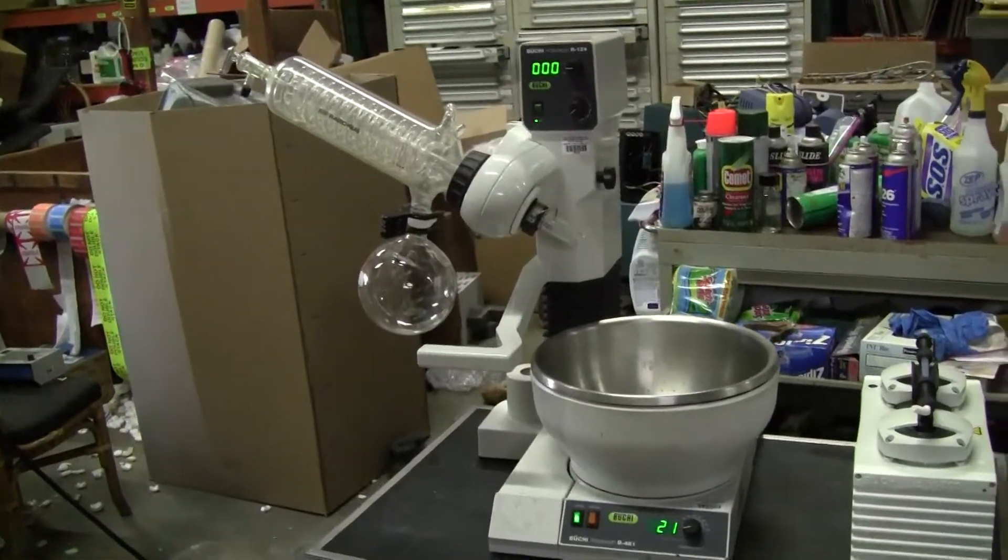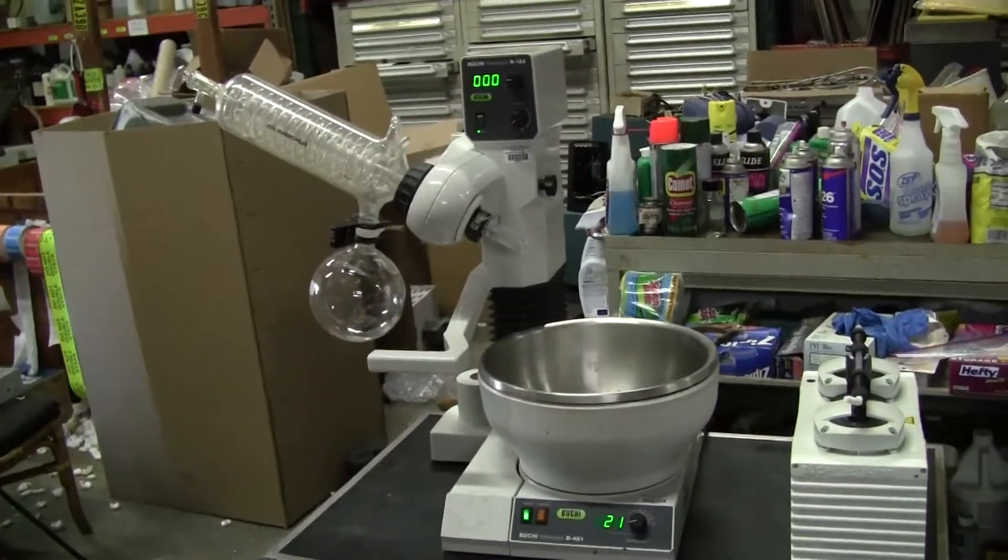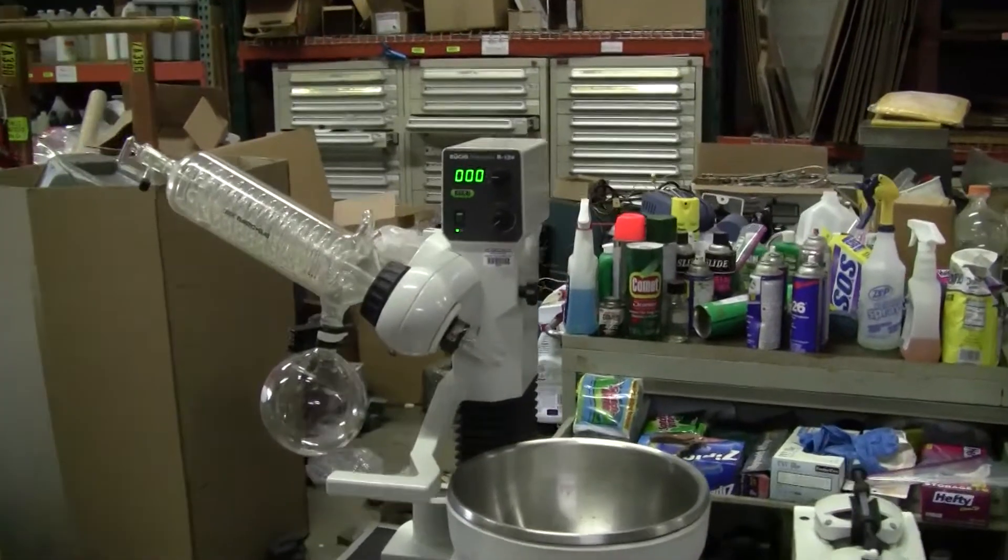Good evening, this is Michael Naitow from High Tech Trader. Today we're looking at a Buki Rotavap, model R124.